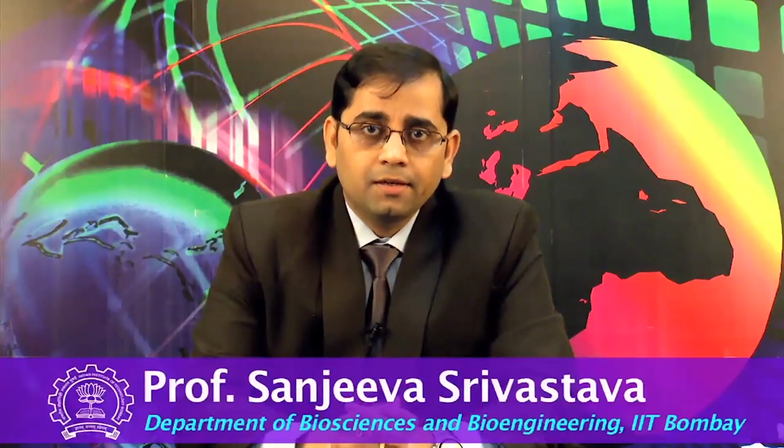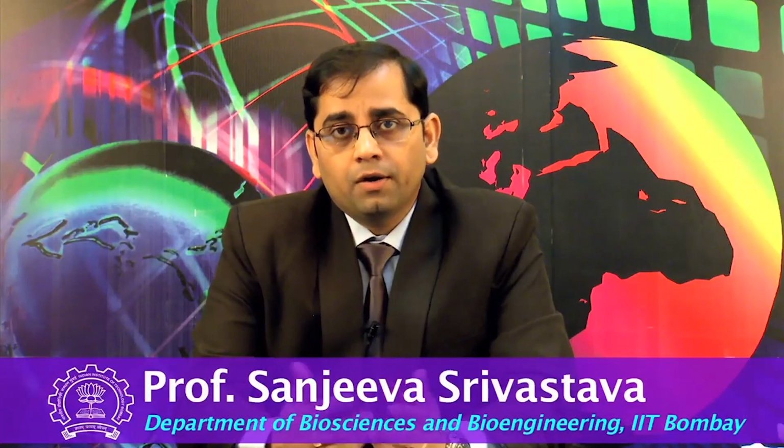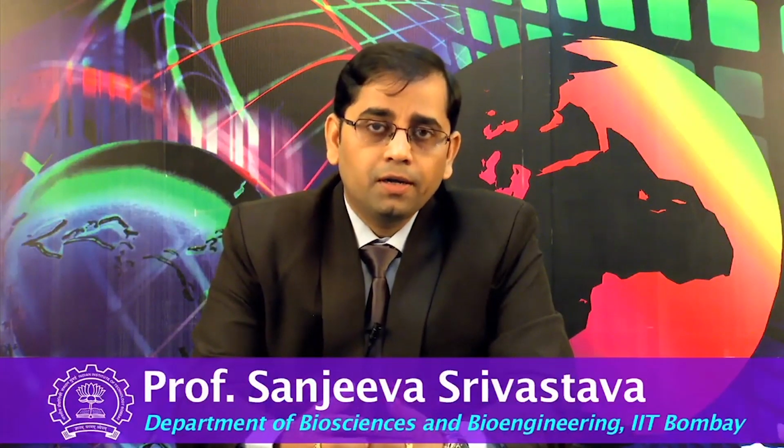As we started discussing reverse phase protein arrays, Dr. Ramesh Unmani, a guest scientist, provided you an overview of how to use this technology for various applications. Today Dr. Umani will continue his lecture and talk to us more about this novel technology, reverse phase protein arrays. In today's class, you will learn how to choose the correct samples for the experiment, the methods for sample preparation, selection of antibodies, spotting methods and signal detection methods.